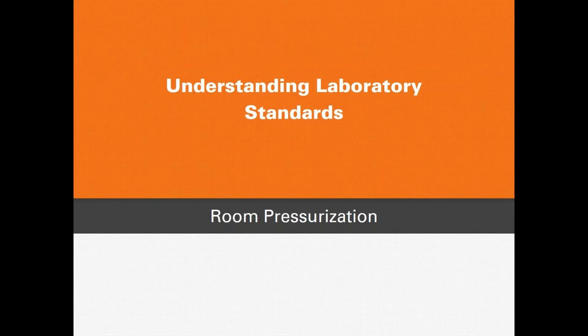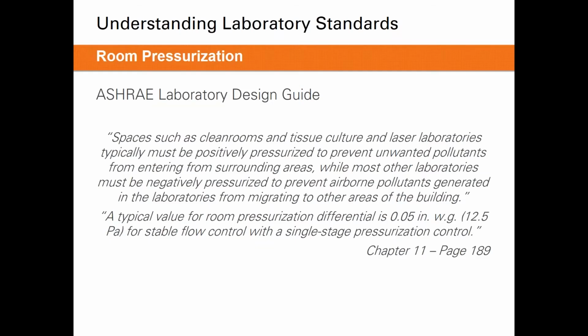The next topic that we'll discuss is room pressurization. Room pressurization is key to ensuring that contaminated air does not pass into a clean space. In the following standards, we'll discuss how the use of the lab will dictate the pressurization of the space. If we first talk about the ASHRAE laboratory design guide, spaces such as clean rooms and tissue culture rooms are typically positively pressurized to prevent unwanted pollutants from entering from the surrounding or adjacent rooms.